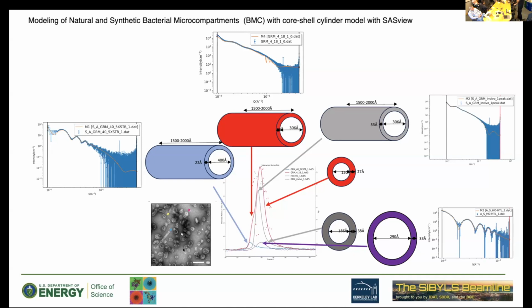I'm also going to mention that Josh will speak a little bit about what we're developing now, validating the AlphaFold models, multimers or single species, single chains. He will talk about how we're using the PAE matrix to move the molecule. Sometimes you see discrepancy, and the AlphaFold models don't fit the SAXS data, especially because it's not rigid, or the multimer is a little off, plus some loops are sticking outside.